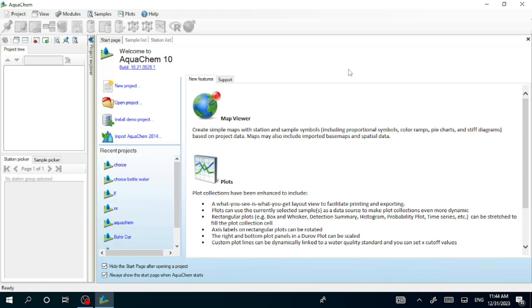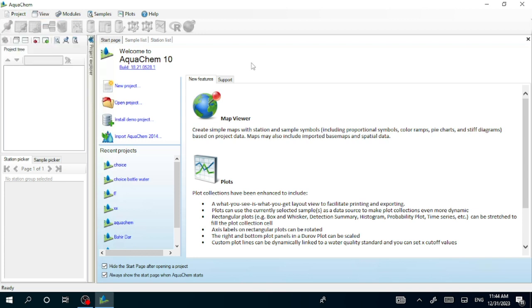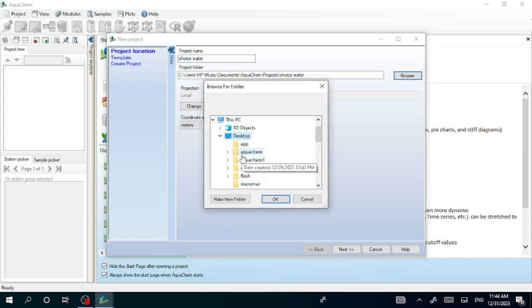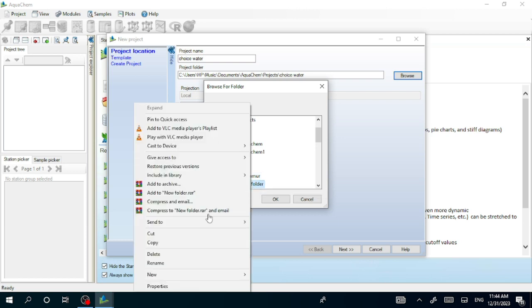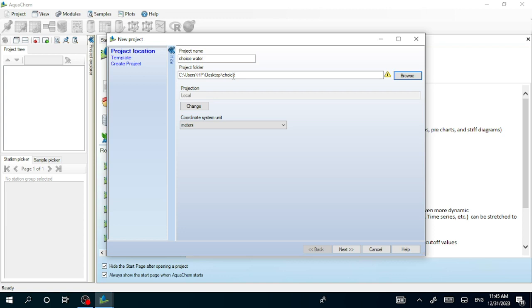The first thing required is to create a new project. Go to 'New Project' — you have the option here or here, either works. Let's name the project 'Choice Water.' You can then select where to save your output; I'll make it easily accessible on my desktop by creating a folder called 'Choice.' My folder is now on the desktop.